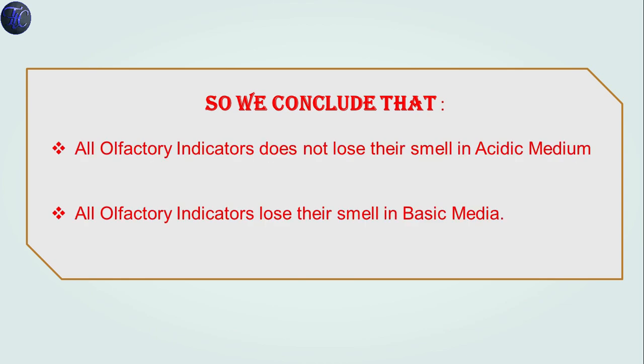We conclude that olfactory indicators do not lose their smell in acidic medium, and olfactory indicators lose their smell in basic medium. So students, you should note down the observations taken from these three activities and the final conclusion that we get after doing these three activities.